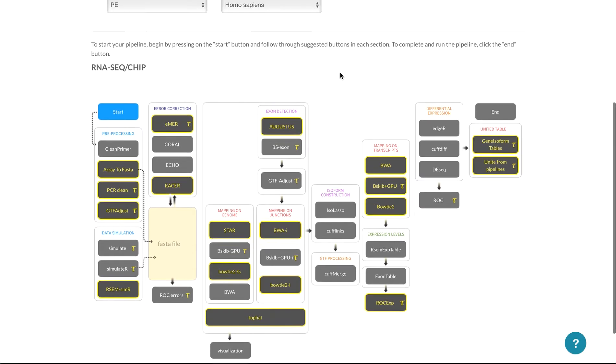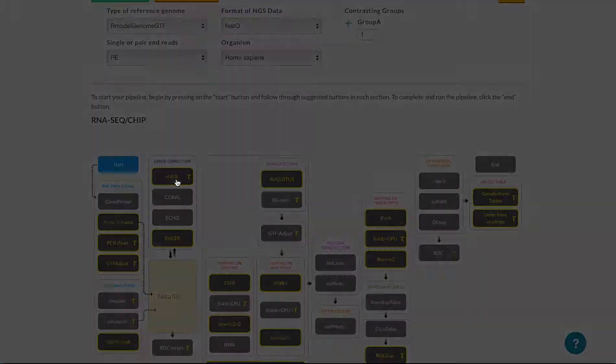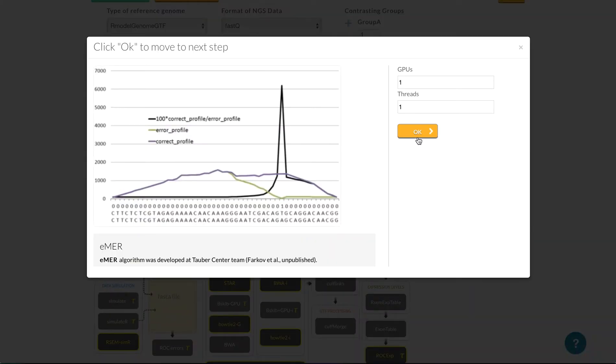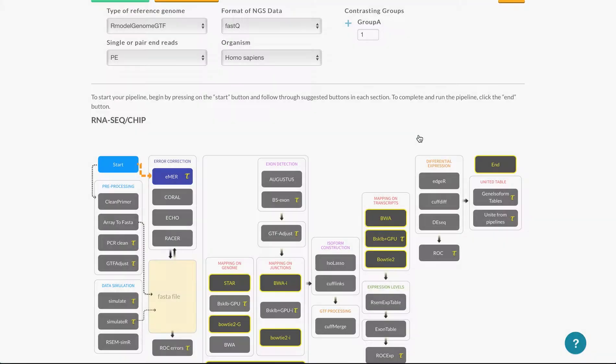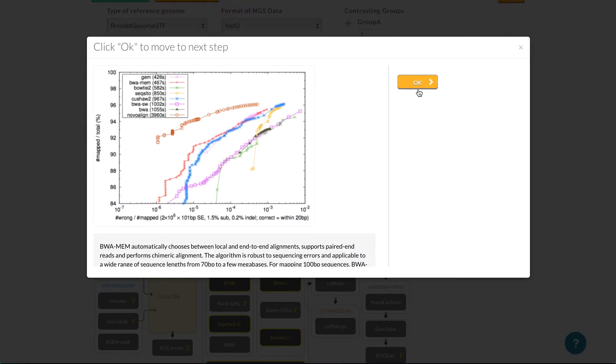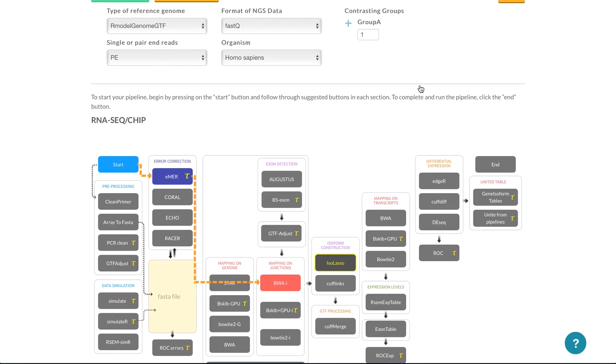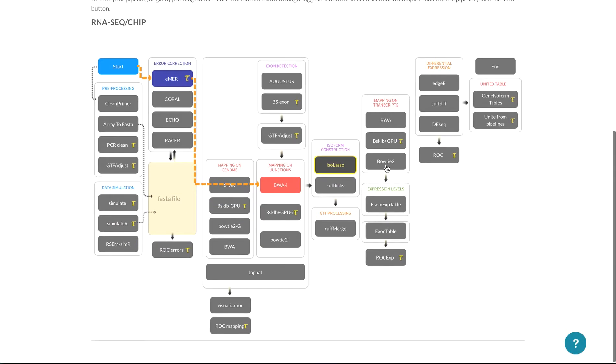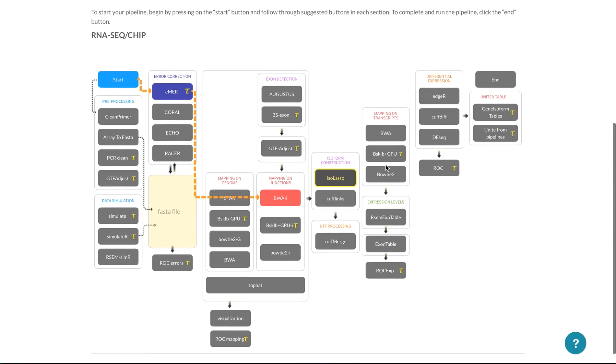So that is how you create the pipeline, and by clicking the button you now see that it's connected. I can now go on and click another button and so forth up until I hit the end button. The end button is not going to be available if you haven't reached a stage where that makes sense.